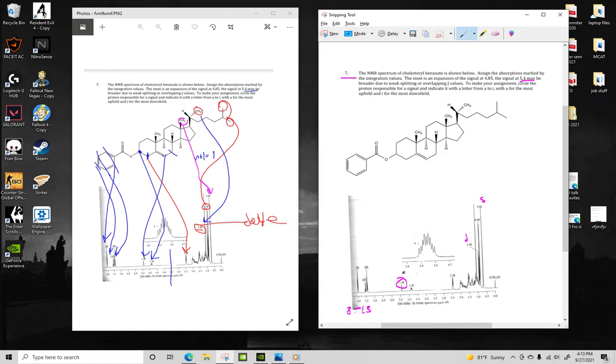All right. So now our next peak, it's at around 4.9. At 4.5 to 2.5, it's going to be a hydrogen that's bound to a carbon that's bound to an oxygen or a halogen.